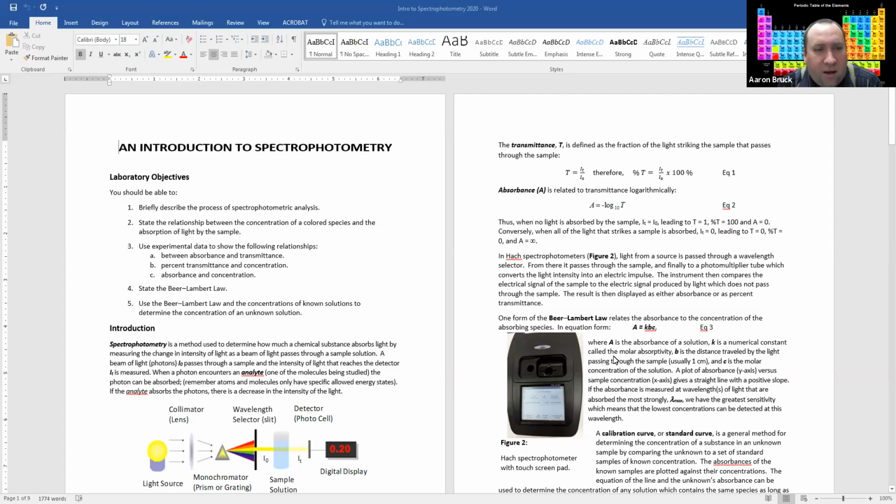Good morning and welcome to our pre-lab video for our week 4 lab in Chem 105 here about the introduction to spectrophotometry. So this particular concept that we're going to be going after today is a relatively simple one. It's something called Beer's Law.